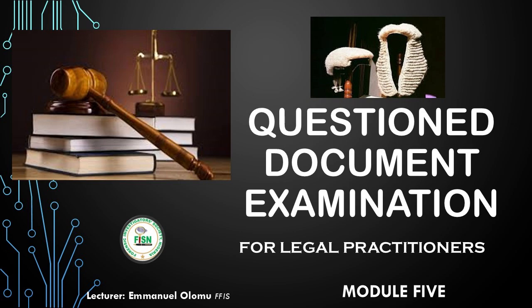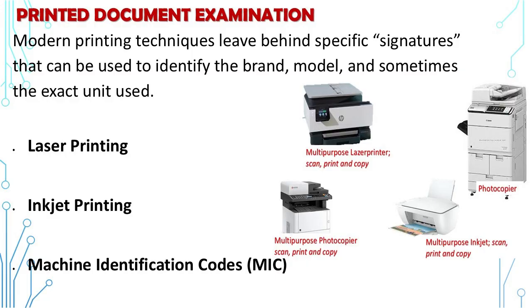The forensic examination of documents has evolved from basic microscopy to a sophisticated intersection of chemistry, digital forensics, and mechanical analysis. Whether a document is produced by a high-end laser printer, a vintage photocopy machine, or exists solely in the digital realm, forensic examiners look for anomalies that betray the document's true history.